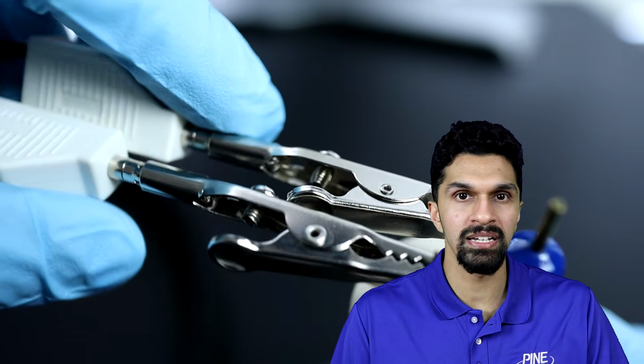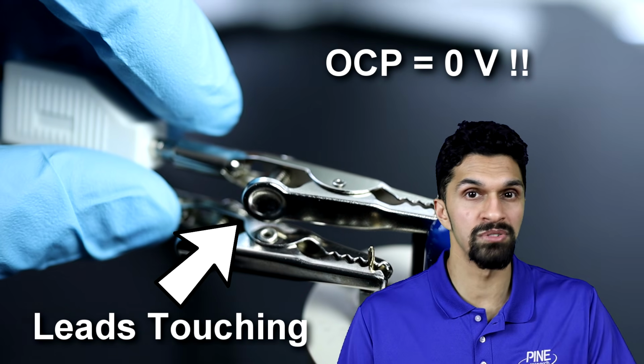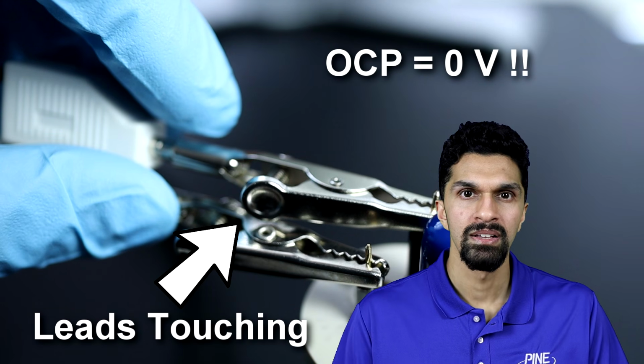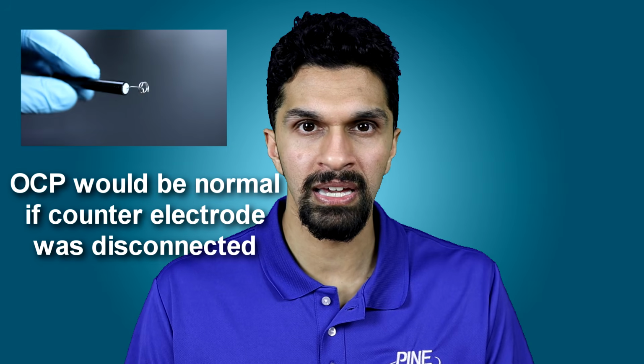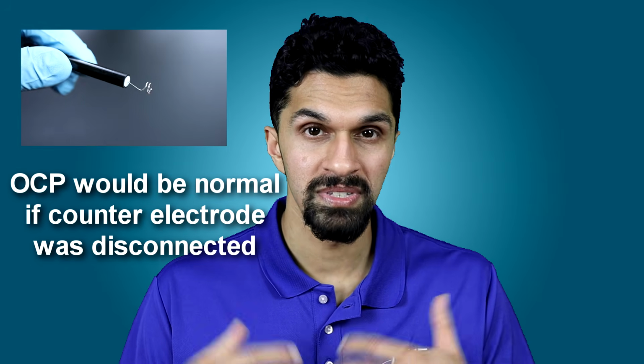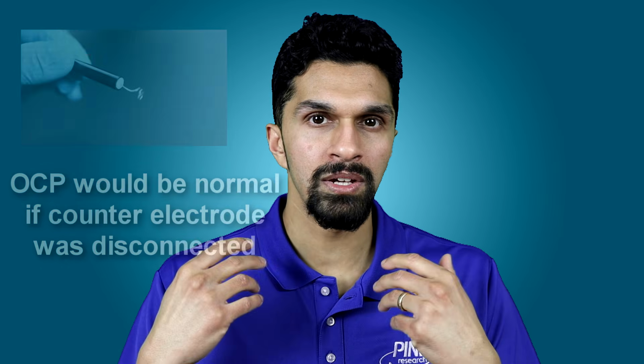Similarly, if I connected my electrode leads and they were touching each other, I might measure an open circuit potential of, say, 0 volts. There's no way that could be the case. So measuring the open circuit potential was a very quick and easy way for me to tell whether or not any of my electrodes were connected or disconnected. Now, it's not a completely foolproof thing. I could still make errors. For example, I could still have forgotten to connect the counter electrode, and the open circuit potential wouldn't save me from making that mistake. However, in this case, I wouldn't run the risk of damaging any of my electrodes.